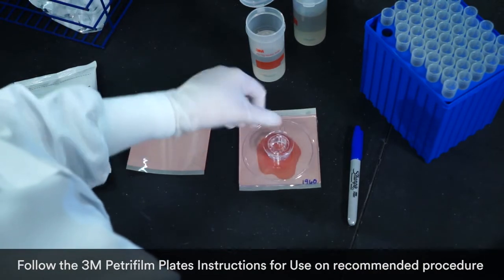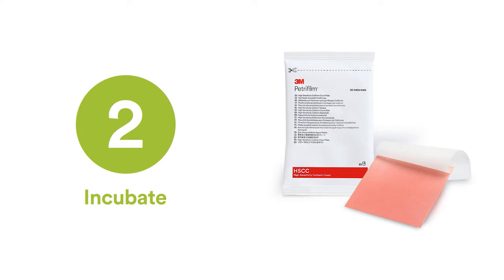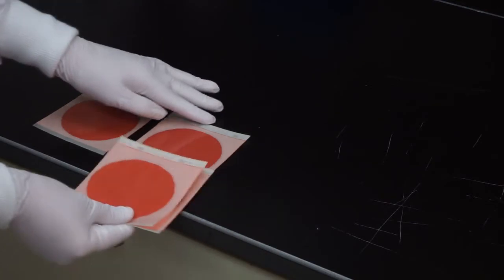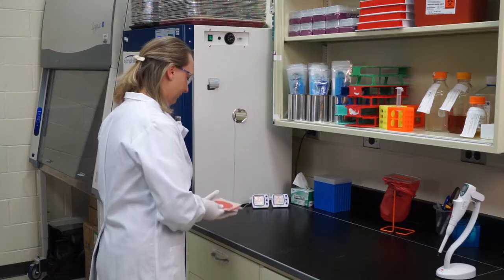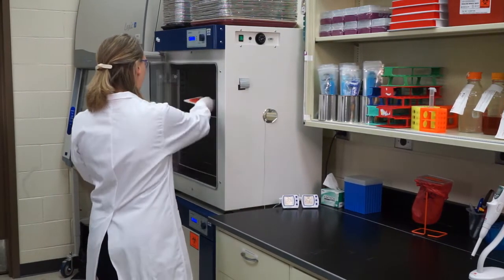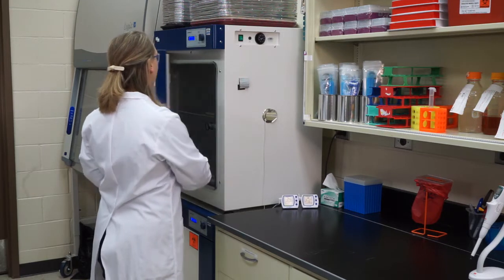Step two: incubate. A compact incubator is ideal for 3M Petrifilm plates because no bulky agar dishes or instruments are needed. 3M Petrifilm plates contain two layers of thin film, providing a space-saving size requiring less storage and less incubator space.